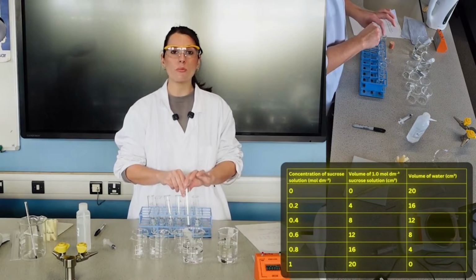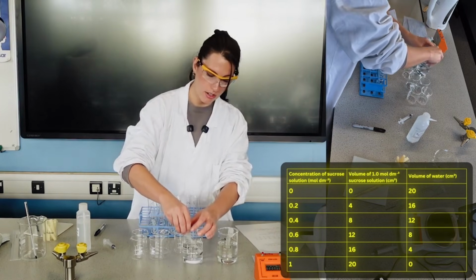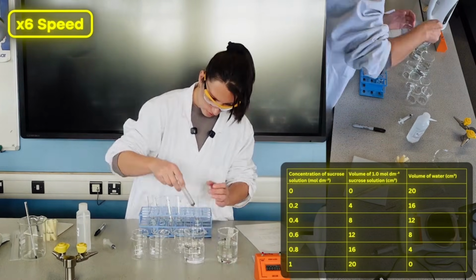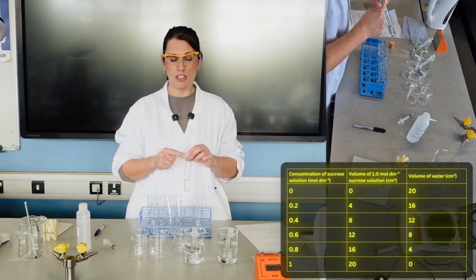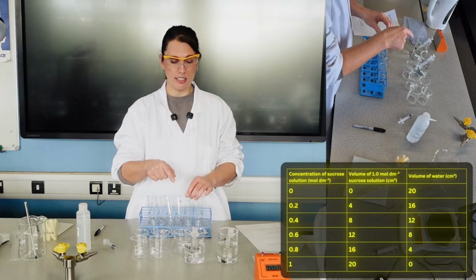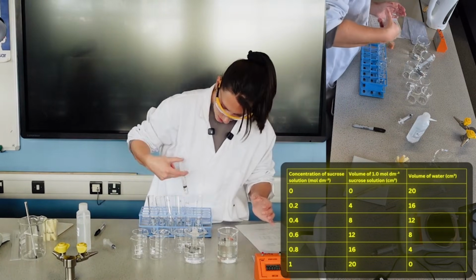And then our final one, 0.2, we're going to need 16 of water and 4 of the sucrose. For the 0.2, we need 4 of the sucrose solution and 16 of the distilled water. Or this one.